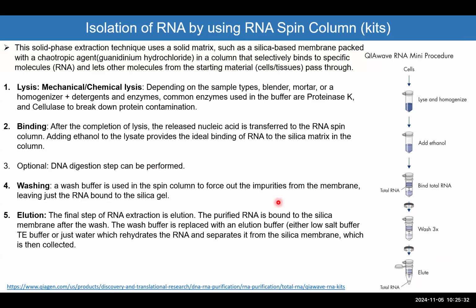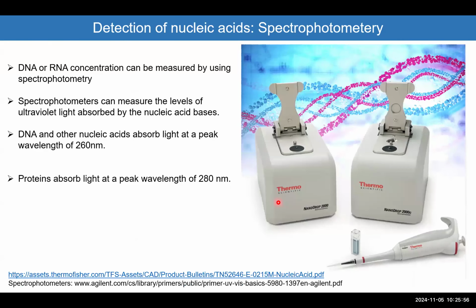So I'm pretty sure we went extensively on those, but I'm going back again and again because I'm sure if you go back to any lab and you will perform a qPCR, the first step is to isolate RNA. And if you don't take good care of those steps, you end up having RNA, but the RNA quality is bad or degraded. And it's important for you to have a good quality RNA.